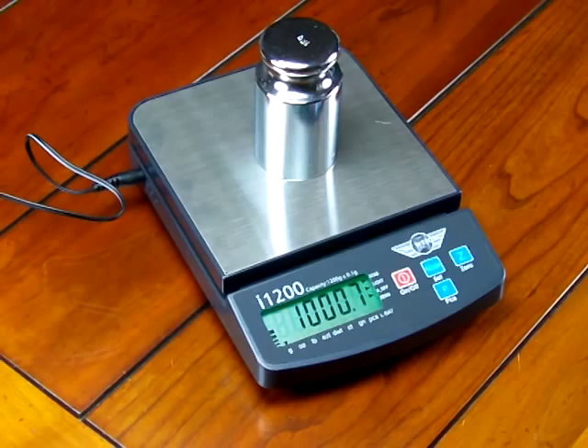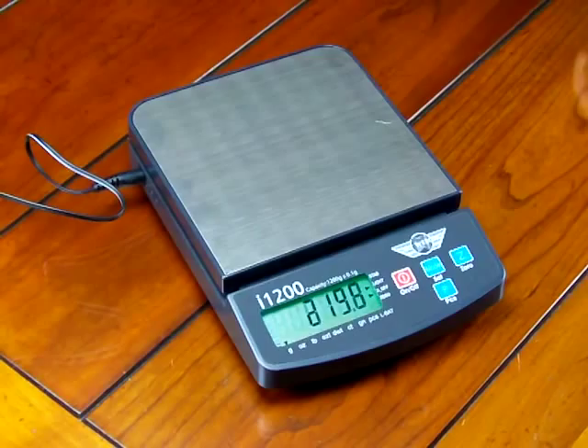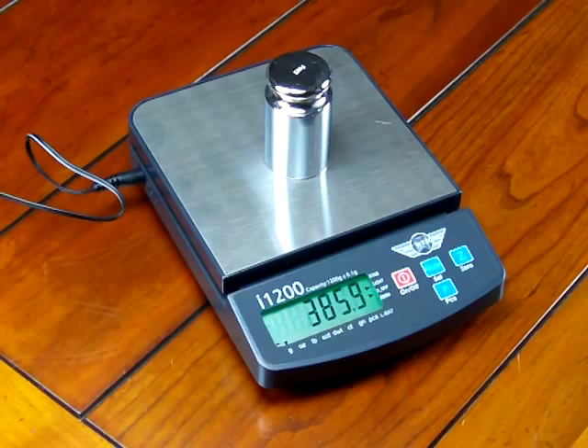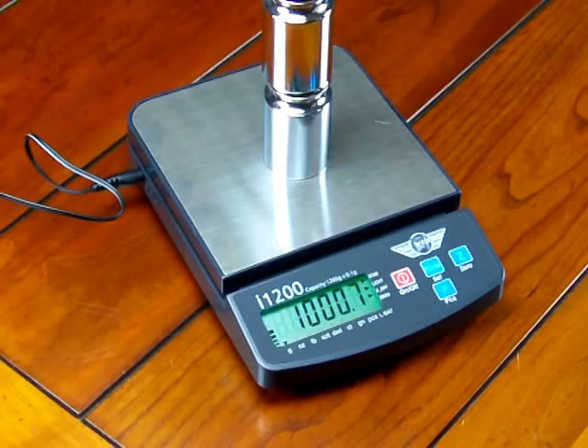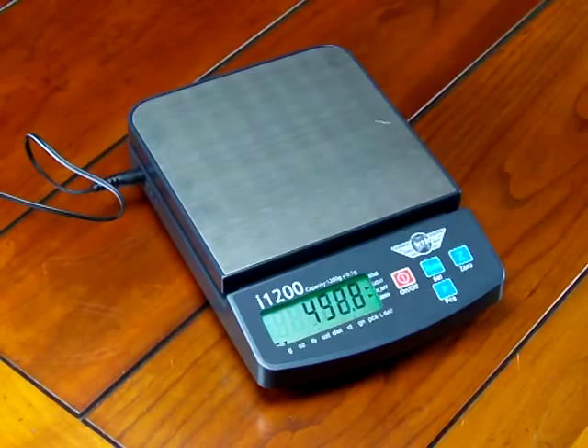The scale by no means is defective — all it needs is to be calibrated. I have a 500 gram weight here. You'll see it reads 500.3, so it's off by 3 divisions. Let's put on another 500 gram weight — now it's 1000.7, off by 7 divisions. So we just need to calibrate the scale.